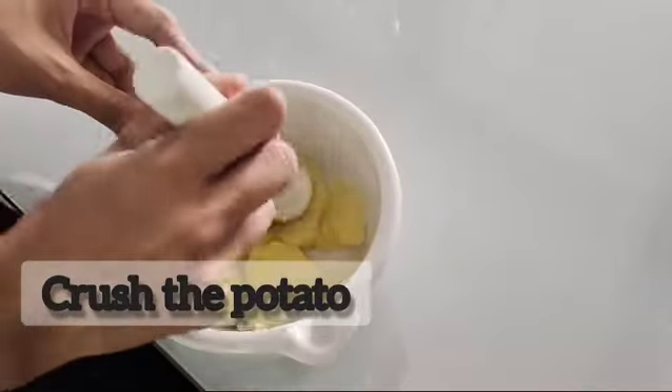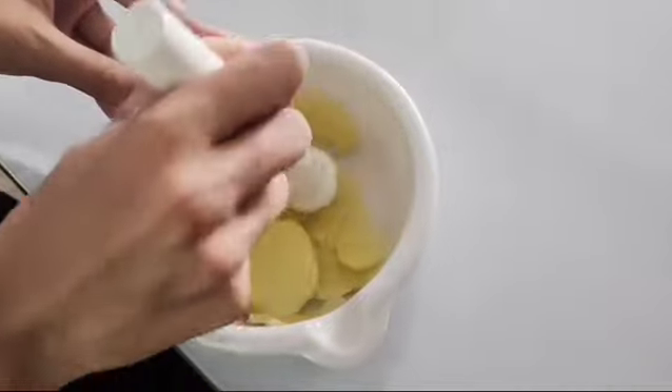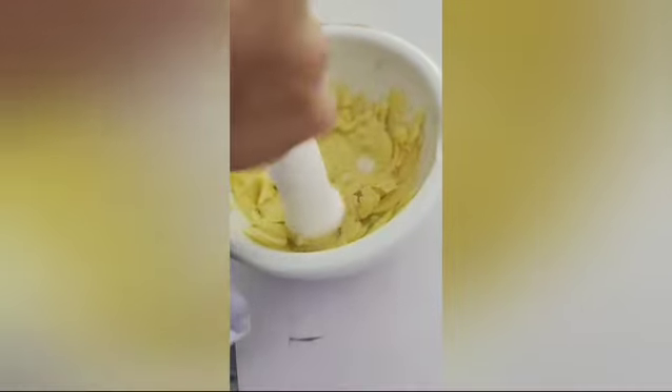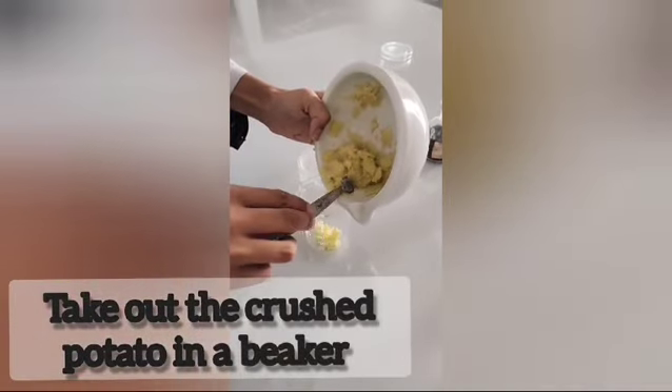Now, crush the potatoes using mortar and pestle. Make sure you crush them thoroughly. Take out the crushed potatoes in a beaker.